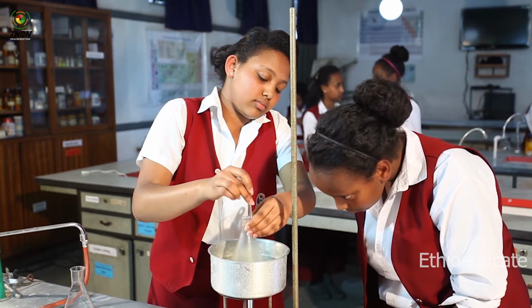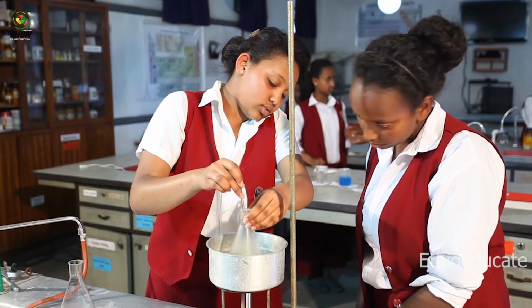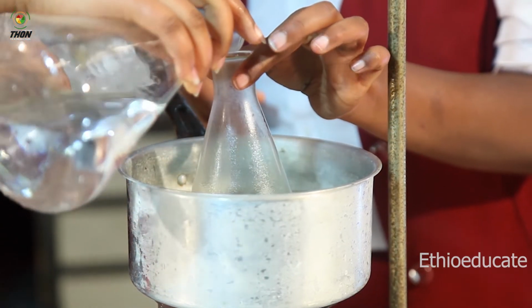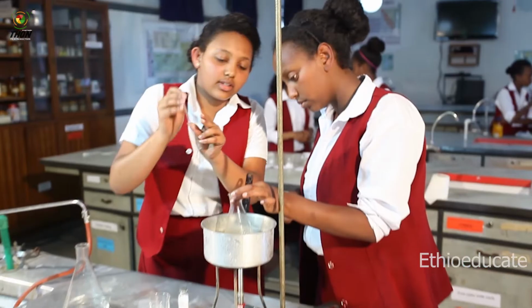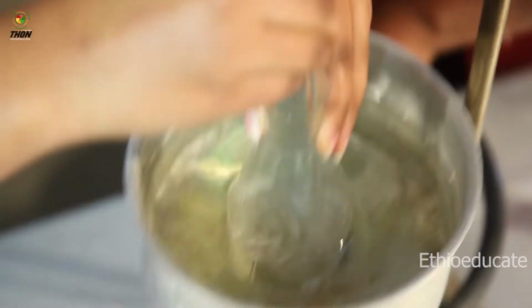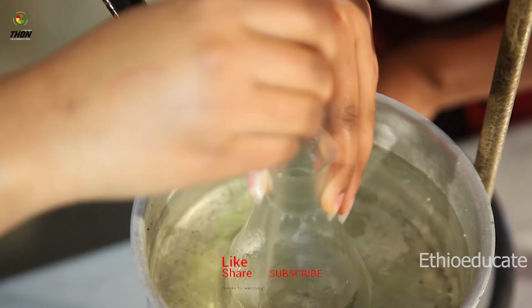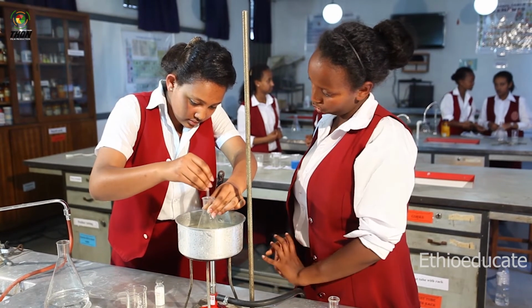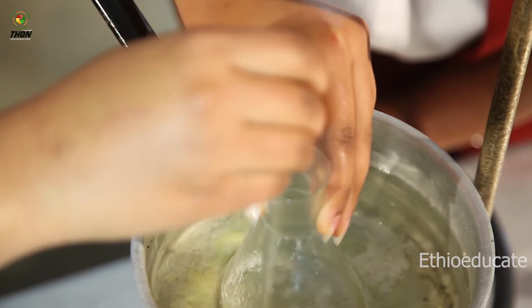Okay. It's going to take some time, but it will be. Let me add some water. Then I'll keep on stirring. As I said before, it will take time, but it will dissolve. Are we supposed to add water now? Not now. We will wait a little. A little more. We will wait a little.